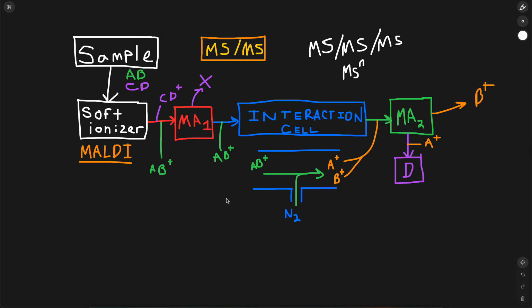For one more thing, we need to discuss some terminology. I forgot, I have this in my notes here. We call these ions the source ions. So these are source ions because they're everything. That's the whole mixture, the source. But AB plus is called the precursor ion.